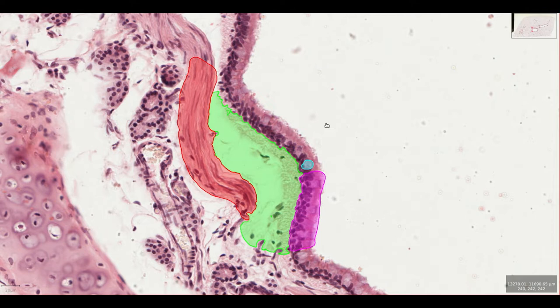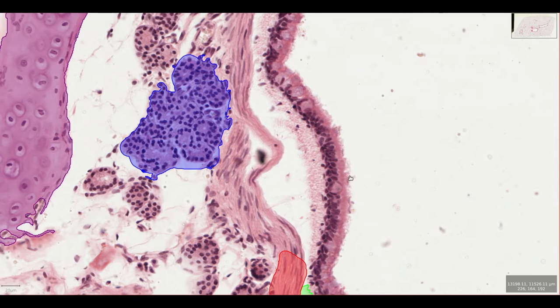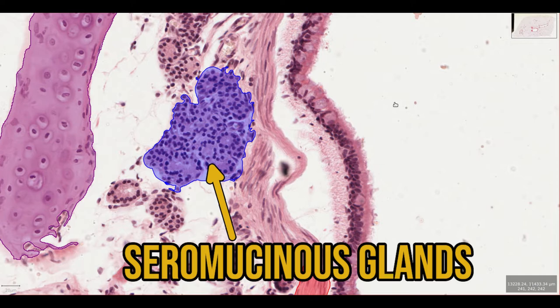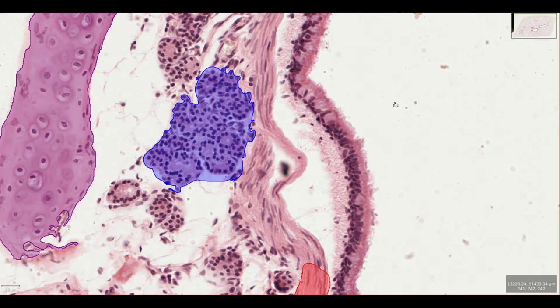Underneath the smooth muscle you'll see lots of glandular tissue. These are seromucinous glands producing even more mucus. This tissue is really plastic, meaning it will respond to changing circumstances like chronic airway inflammation, during which these glands expand in size and number.